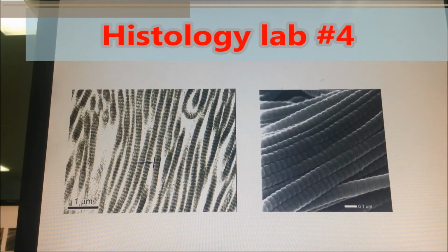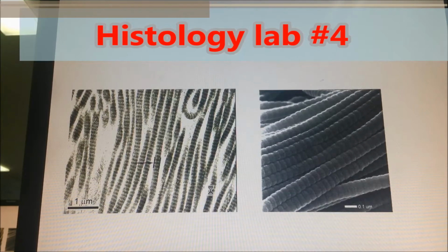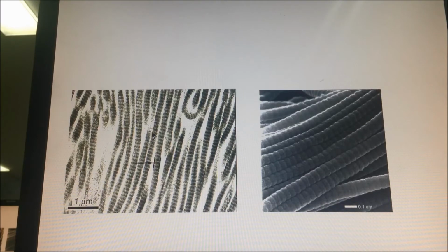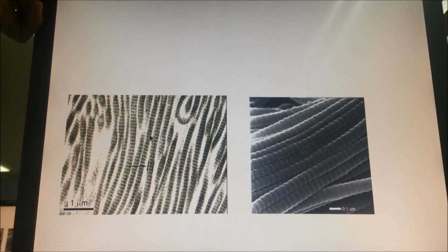أهم نوع من الفايبر هو الكولاجين. نيجي نطلع هون over here. This is a transmission electron microscope for the collagen fibers. How to identify that these are collagen fibers? The collagen is striated, banded. You're going to see a dark band, light band, dark band, light band, etc.